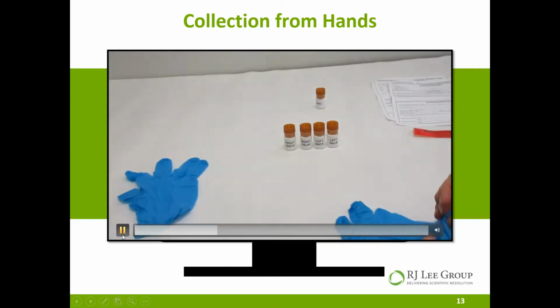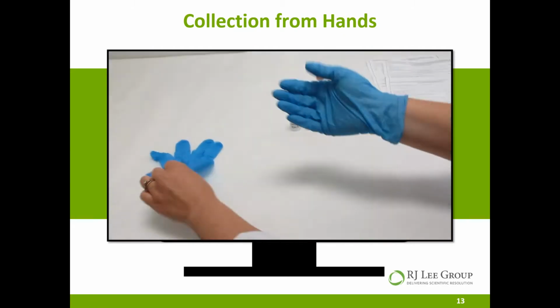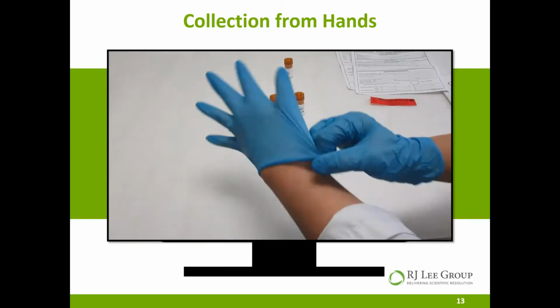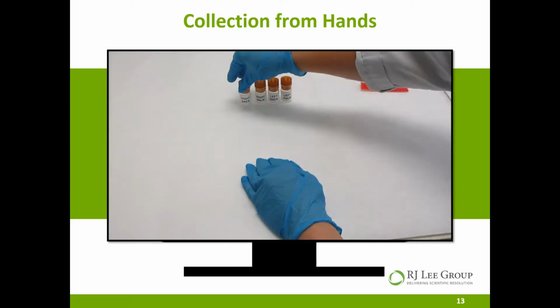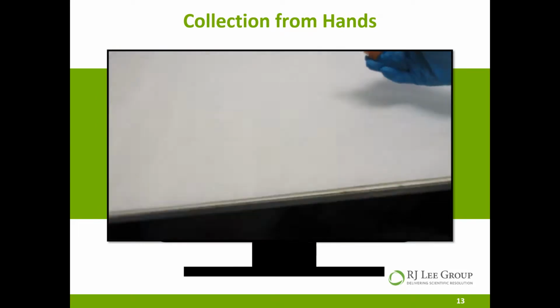Okay, now I'm putting on my PPE, my latex gloves that were included in the kit. Well done, Allison. This is the right back stub.